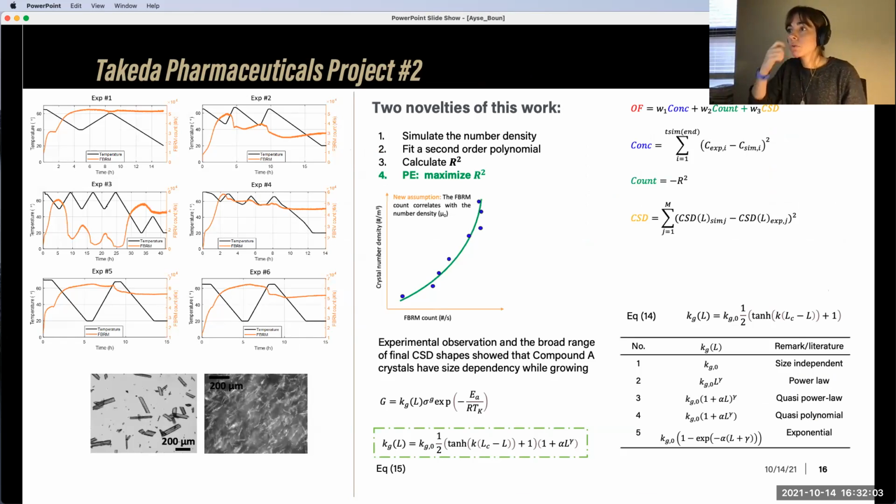And then I'm going to show you another project within the same workflow. But this time I used their real cancer drug to do the same thing, basically. This was a little challenging because what I showed you before was a model compound. It was very nice. It was more like spherical almost. It had that nice shape.